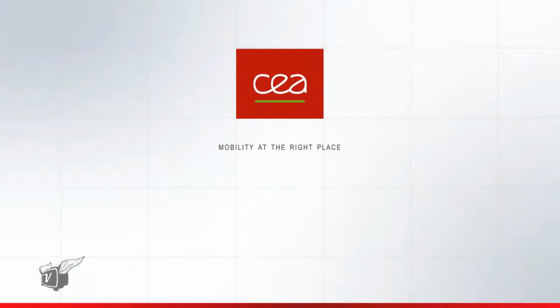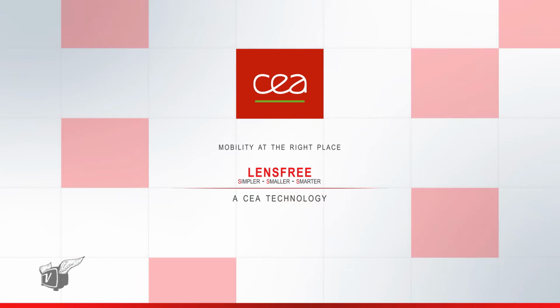Yes, so indeed we have a solution. So this is a small microscope. It is a non-conventional microscope because it's not exactly like a conventional microscope. So if I had only 3 words to describe this system, I would say that it is smaller, simpler, and smarter. Smaller, you can see, it's very small.